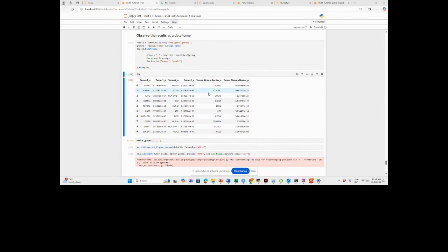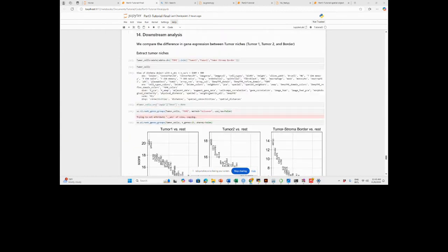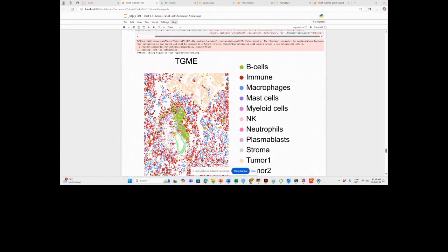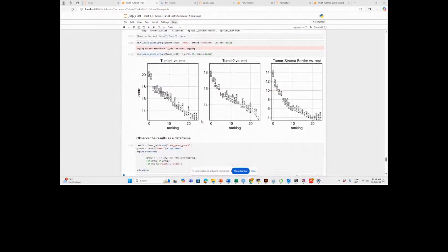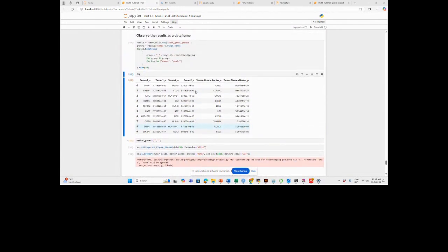This is a very standard analysis, right? Yeah, I already showed them the microenvironment results. Yes, the results of this that you are showing now. And then the results of these, well, here I was just explaining them that we can get the top genes. So let me just put them in here. So we can visualize them as a dot plot to observe the differences.